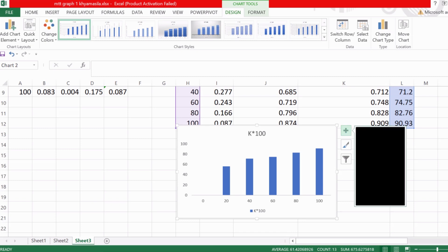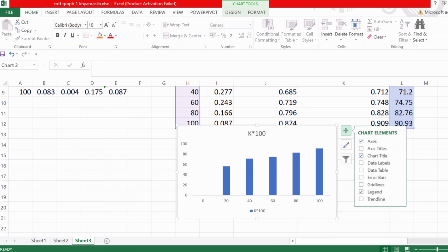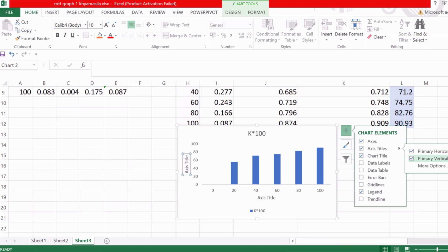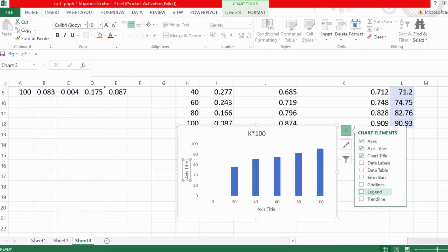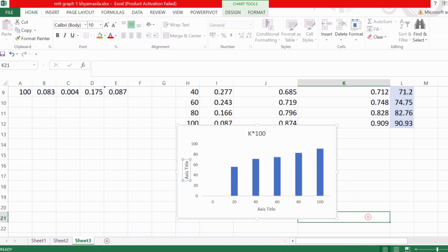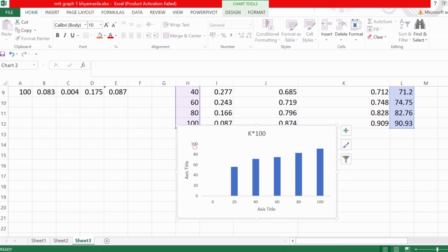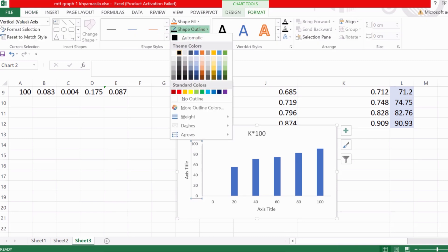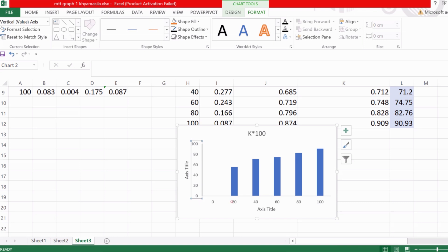You can add axis titles from the chart options — add both primary horizontal and vertical axis titles. You can also remove the legend or add it at the right side. You can change the values shown on the X and Y axes as well.